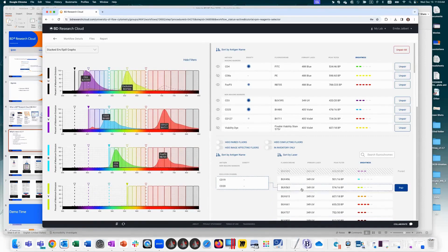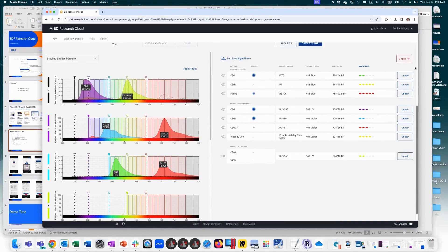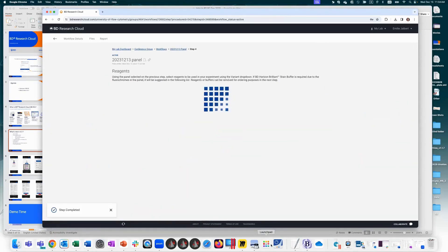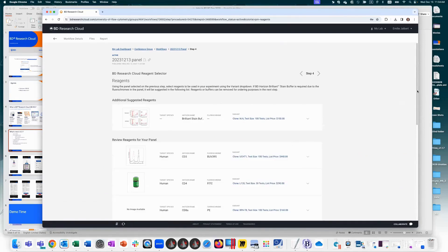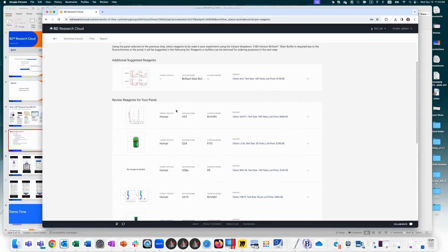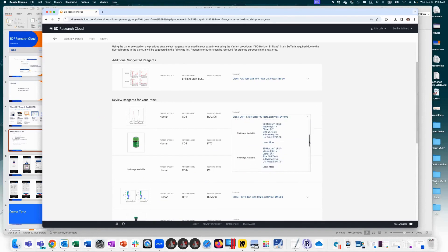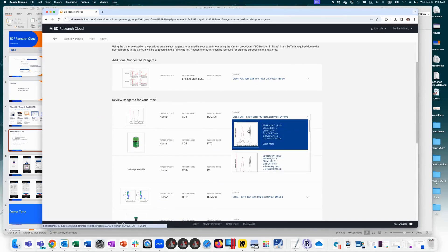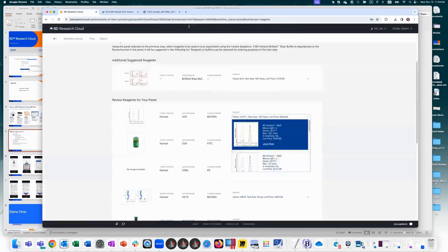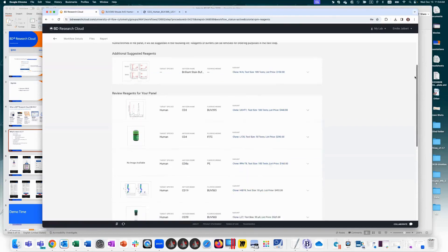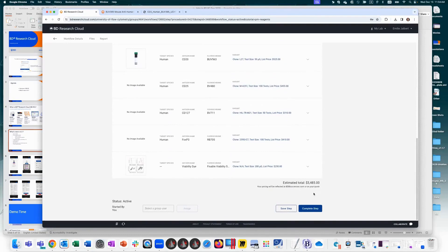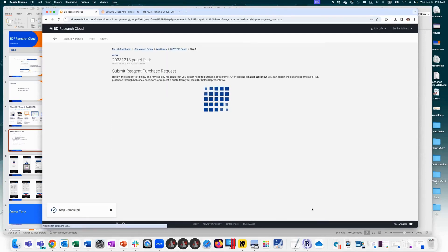Once all markers are paired with fluorochromes, step four shows available reagent options. For CD3 BUV395, different test sizes and clones are shown. You can click the image to enlarge it or click 'Learn More' to go to the BD website. You can change selections based on test size or clone preference. List price is shown for individual markers. Once happy with decisions, click complete to finalize the shopping list.